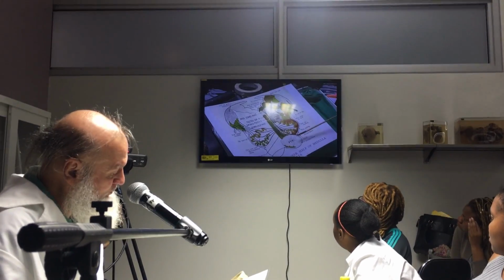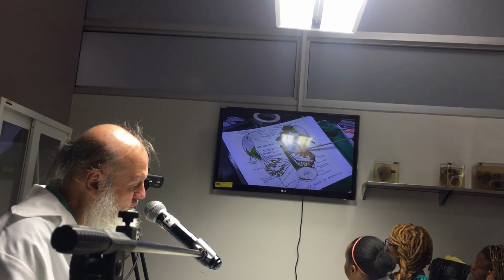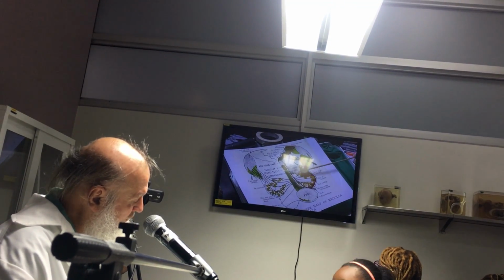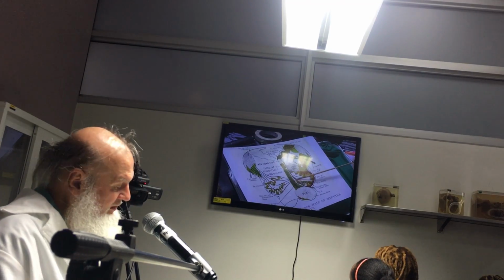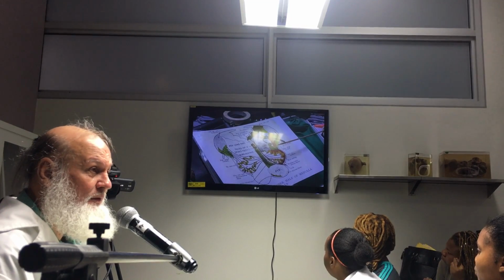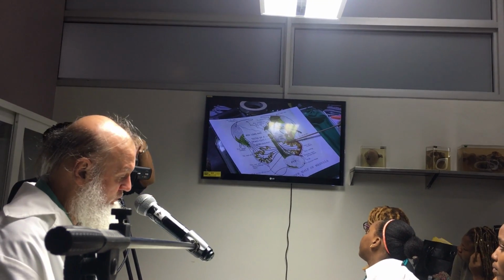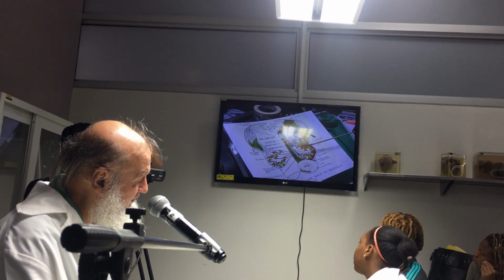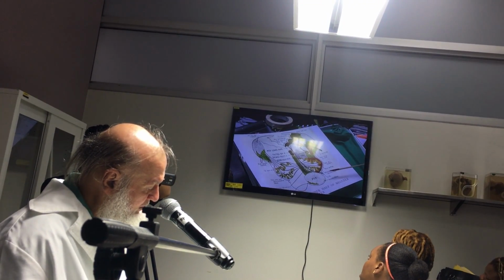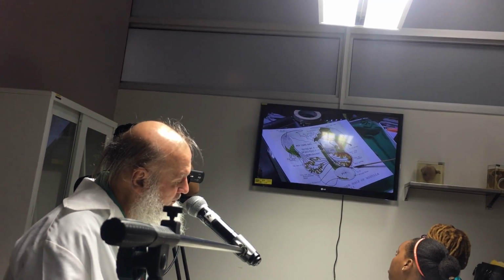Then, if this is the pyramid, we see beside it the olive. Focus on the olive. Okay, see the olive there? And there you can see the fibers here. These are the climbing fibers, the olivocerebellar fibers. That's the olive, and you see they're crossing to the opposite side. And by the way, if this is the pyramid and that is the olive, then we see cranial nerve 12.